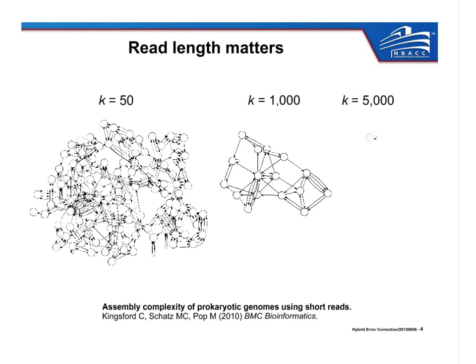So why does read length matter, and why do we want long reads? I'm displaying here, as I bring up the laser pointer, assembly graphs from E. coli K12 genomes. So this is a very simple genome relative to some of the other complexities that are out there. And we've displayed 3 assembly graphs. These are De Bruijn graphs, assembly graphs, string graphs, whatever you'd like to call it, constructed with different word sizes to represent a range of sequencing lengths.